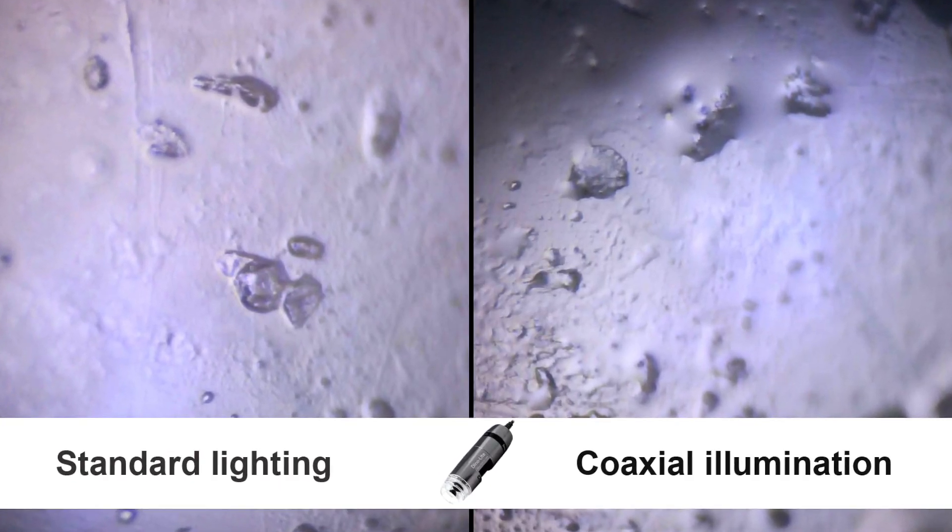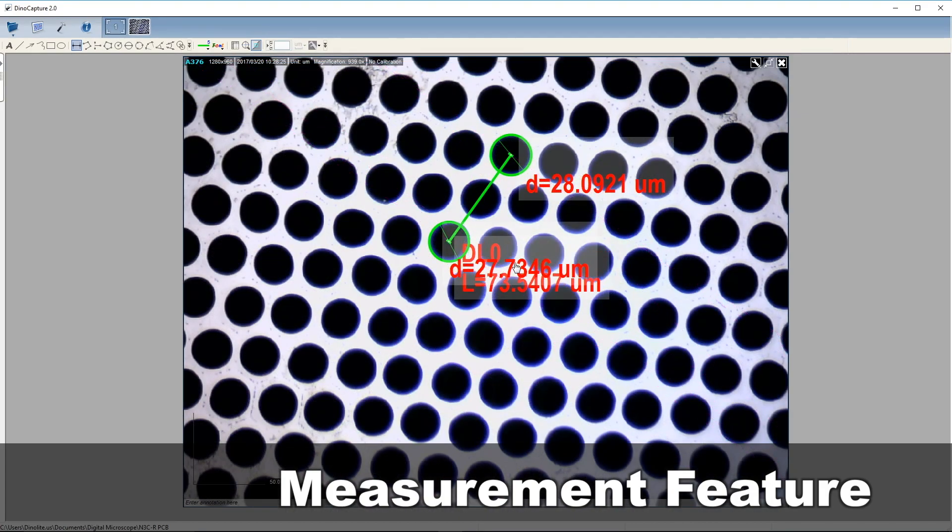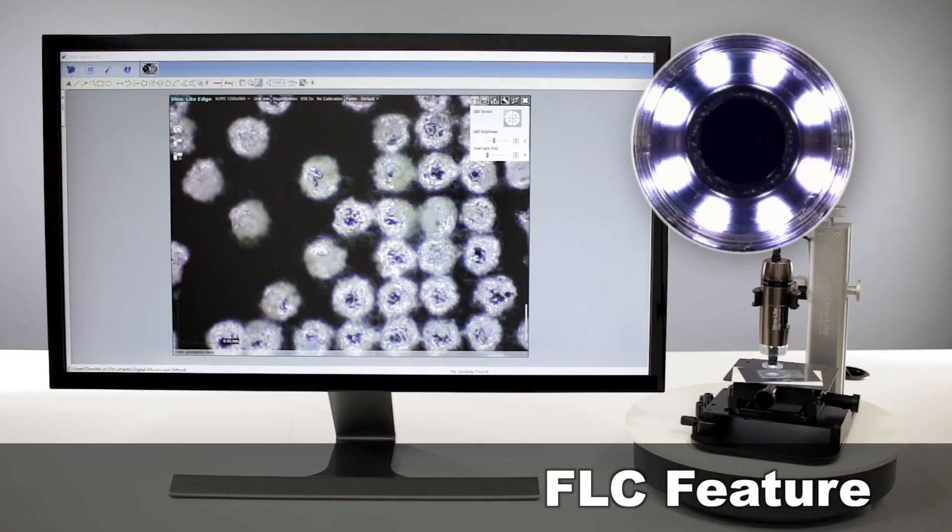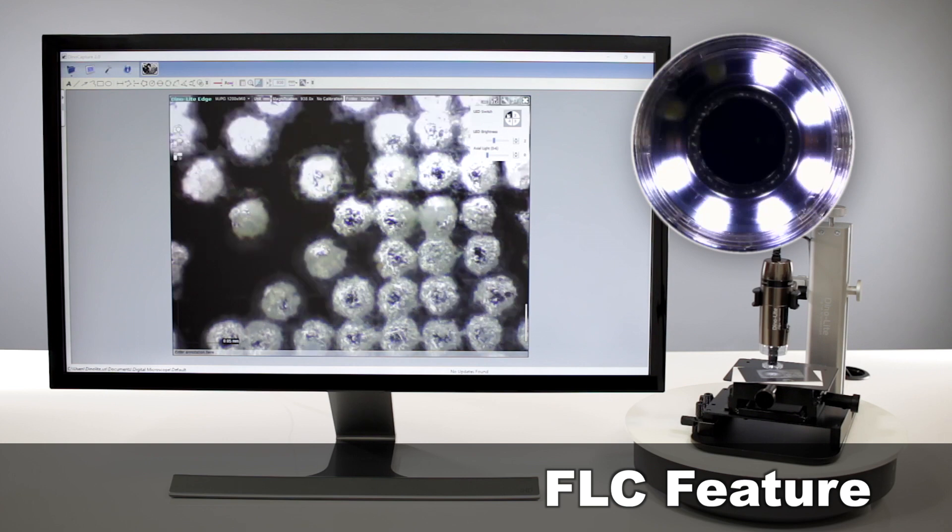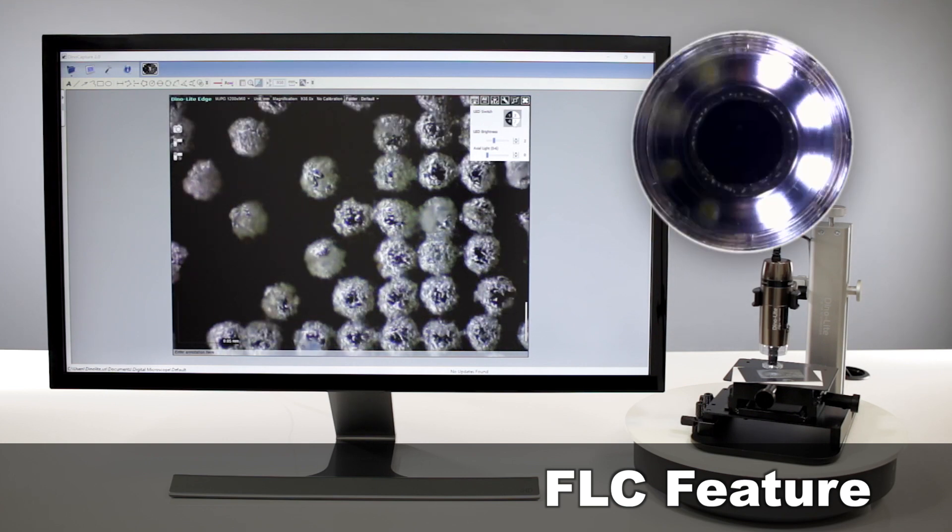The included software and its features such as measurement and lighting adjustments increase viewing and inspection effectiveness.